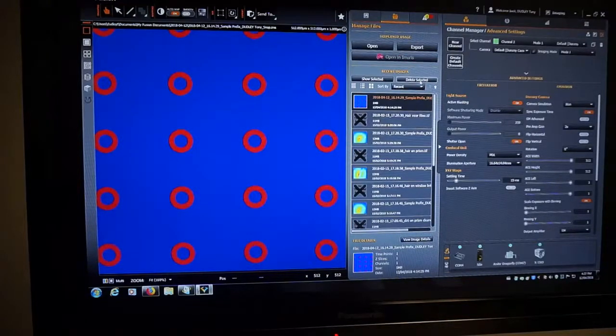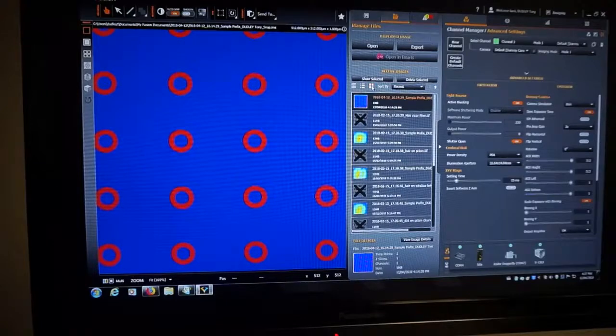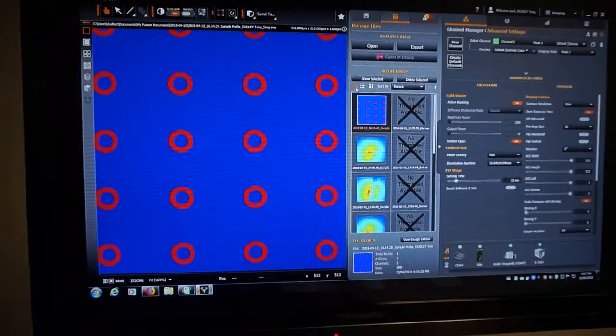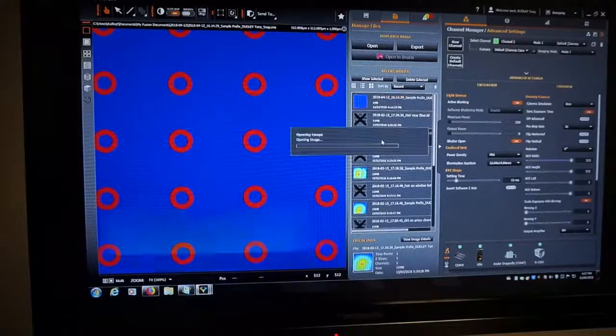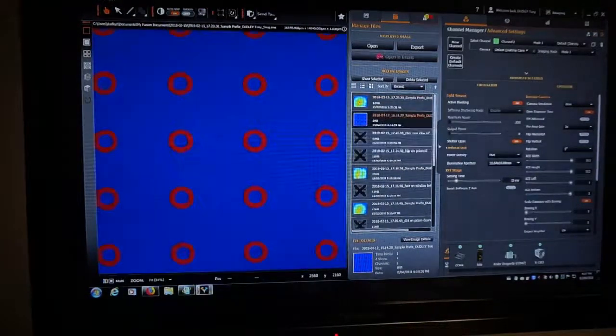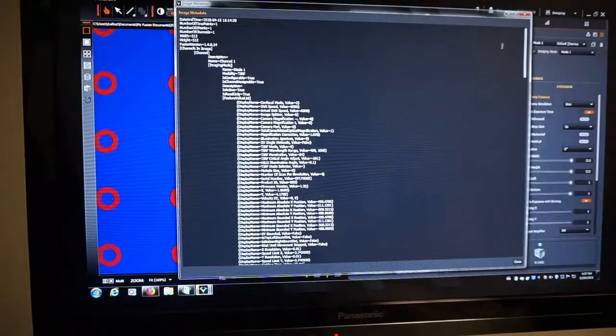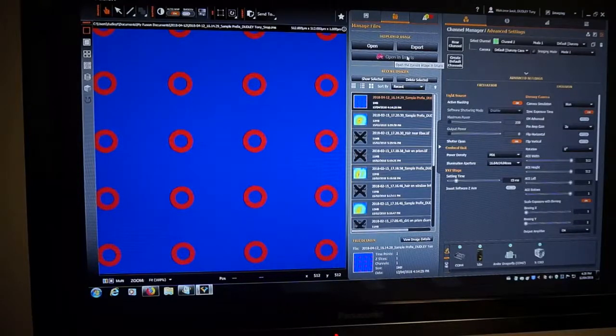Okay, so file manager is just like from IQ. So you can sort by date, file name, size, time points, slices. You can display as a list with details, or just thumbnails. Okay, I think everybody mostly likes this view. Double click to show an old image. Come back to here. View image details. Okay, so I guess all the image metadata you can view by clicking that button. Open in Imaris. If you've got Imaris connected, you can do that from here.